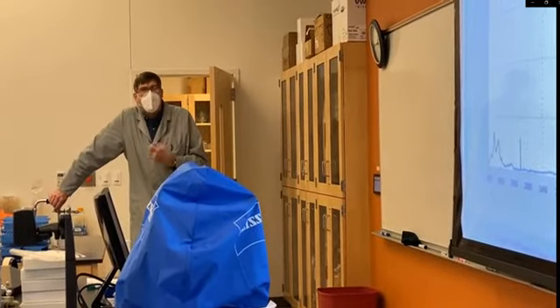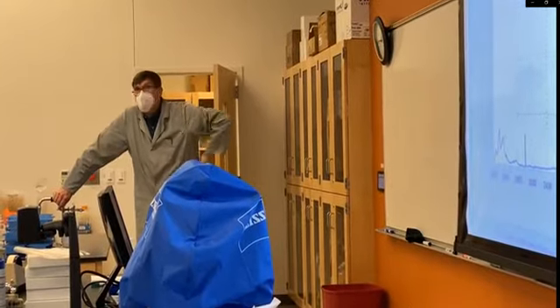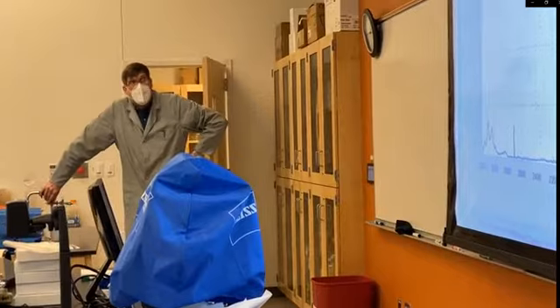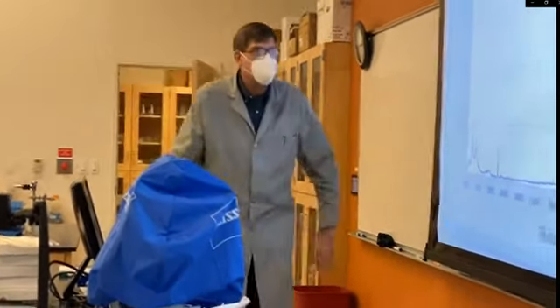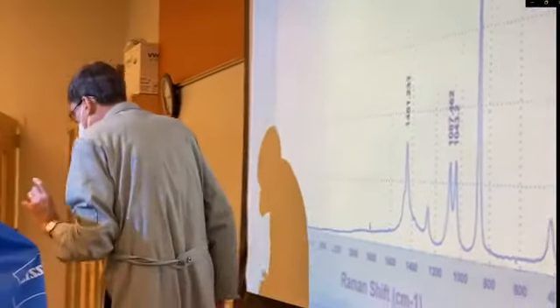You can predict then the ethanol concentration in the two samples and see how well it agrees with what the label says.